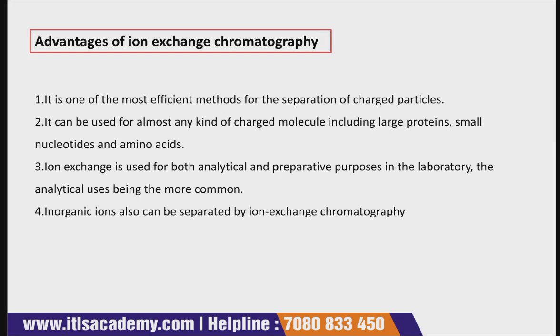It can be used for almost any kind of charged molecules, including large proteins, smaller nucleotides and amino acids. Ion exchange is used for both analytical and preparative purposes.